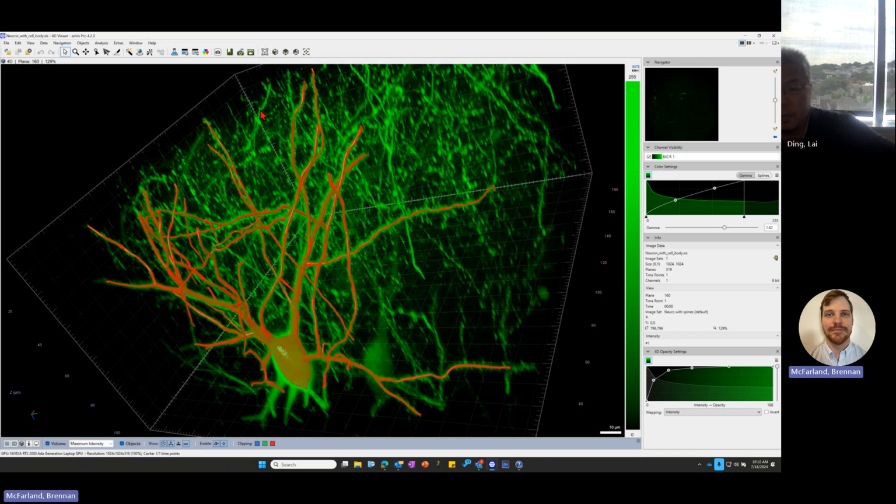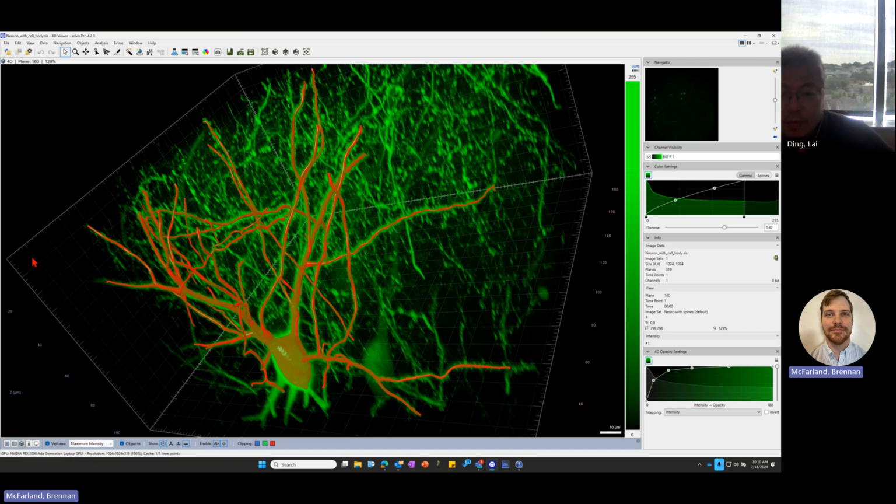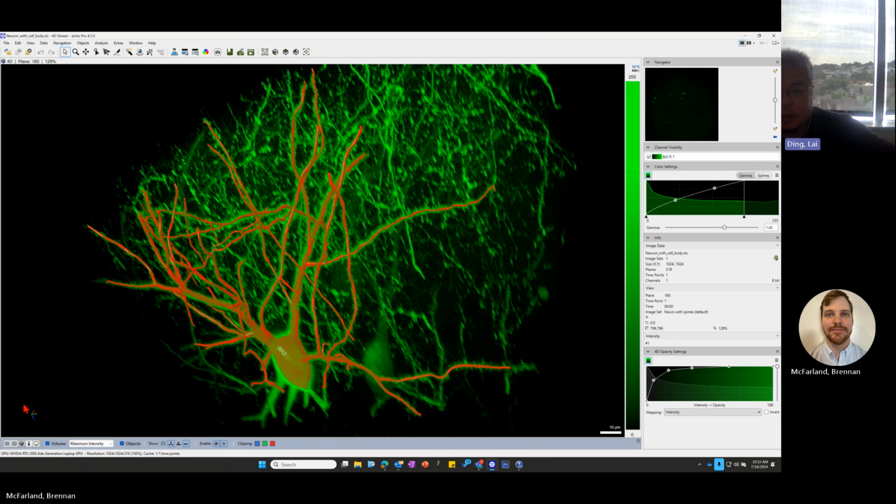And then if we want to go and create a movie, just a quick question: how do I get rid of the frames, the XYZ frames, like just showing the sample? Turning these off. Oh, yeah. Thanks. Good. Yeah. So any of the buttons down here will toggle it. I think it's going to be the coordinates, so kind of the length of where that image is, or the size of that image, and then this will give you the perspectives. Okay.